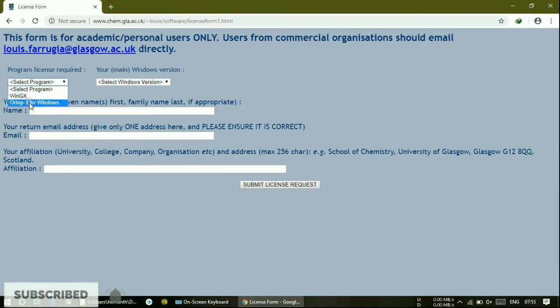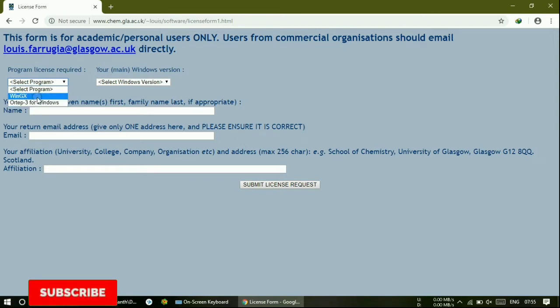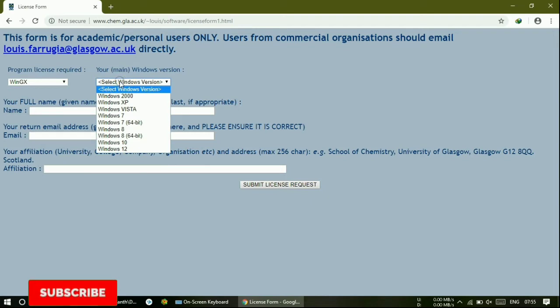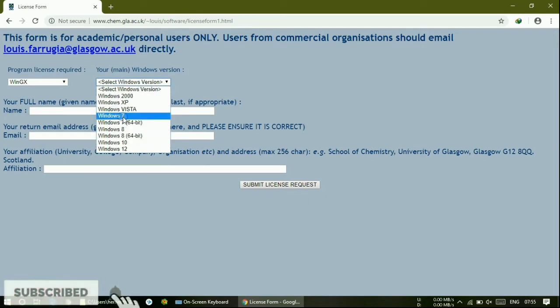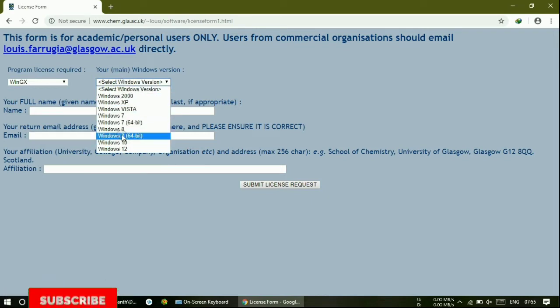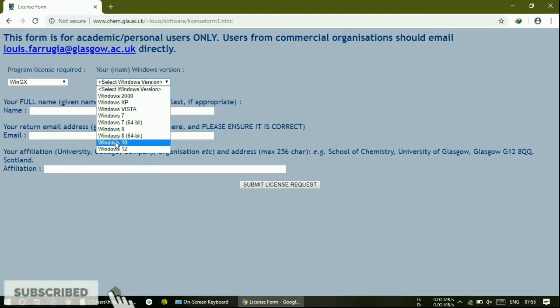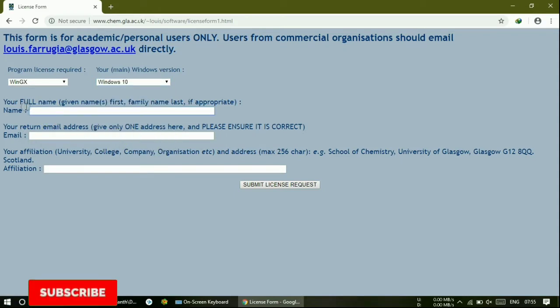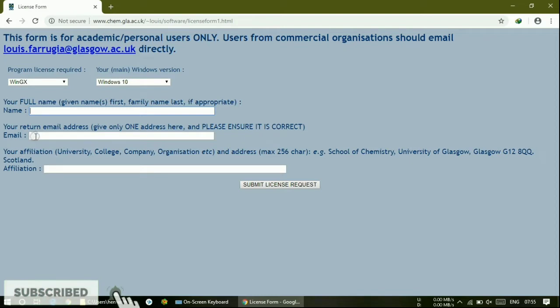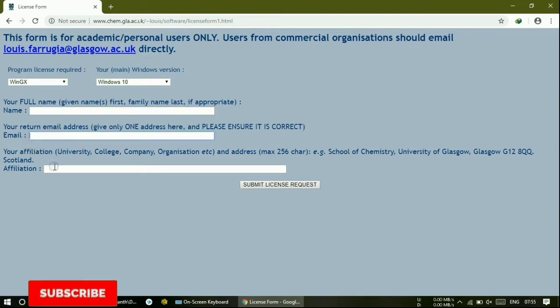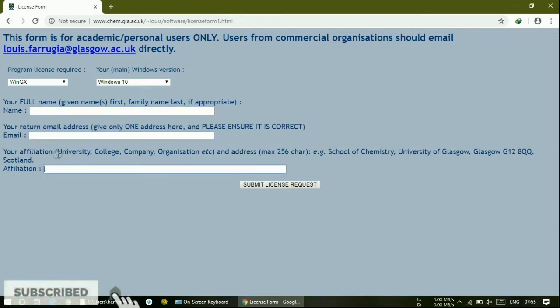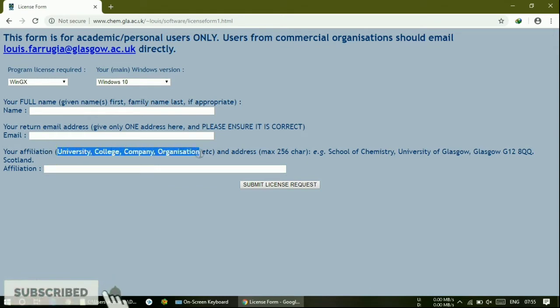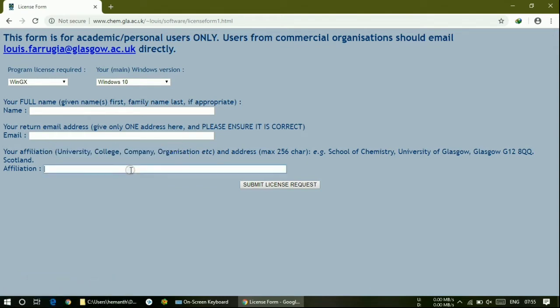After clicking the license button, they show: 'please click here to submit license request.' Just click onto this. After clicking, you must select the WinGX program or ORTEP3 — anything you can select. I am just clicking WinGX here. Next, select whatever version you are using. Afterwards, type your name and email, then your college or university, company or organization. Then submit the license request.